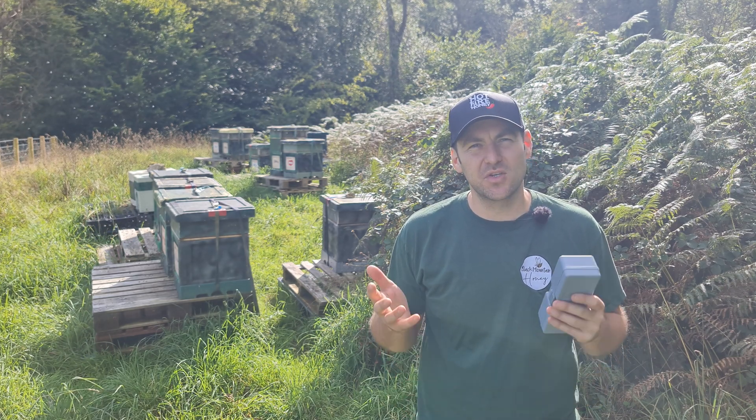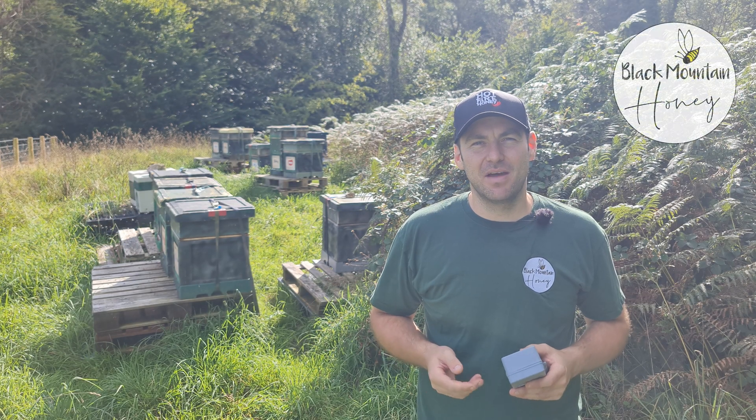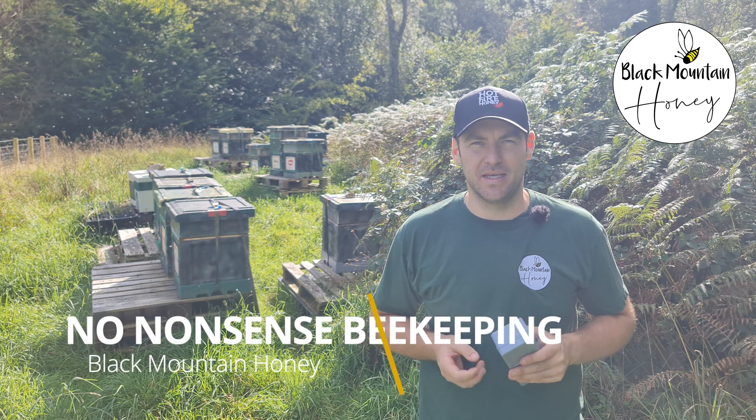Today I'm going to show you how to use a refractometer. I'm Lawrence Eddison, Black Mountain Honey. Welcome to another episode of No Nonsense Beekeeping.